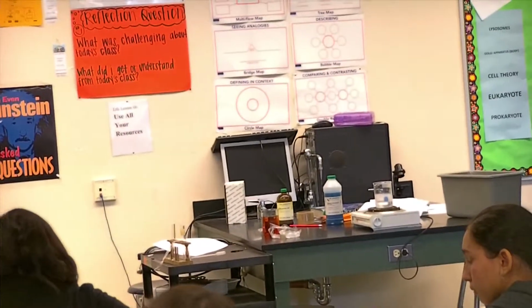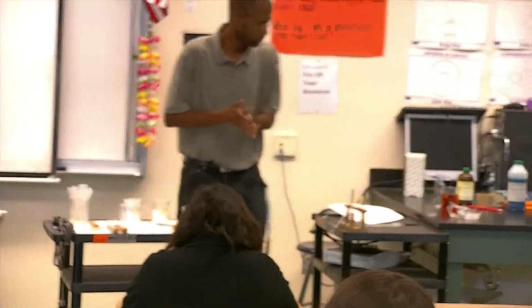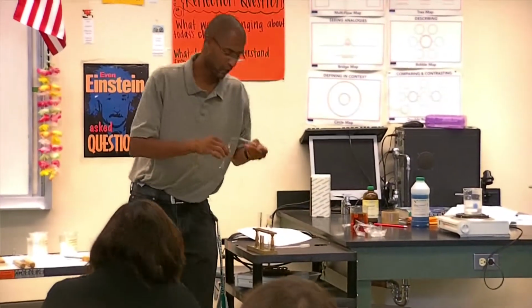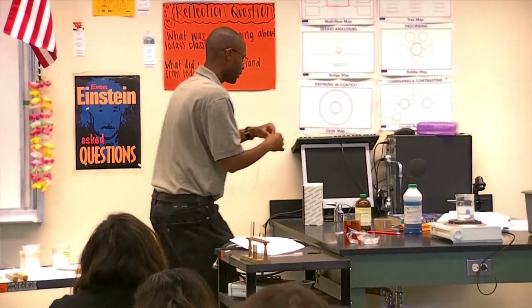What's the next thing we need to look at? Well, we know water is clear. And we told you about iodine already. We're going to take our dialysis tubing, like so, and add just a little bit of water to it.